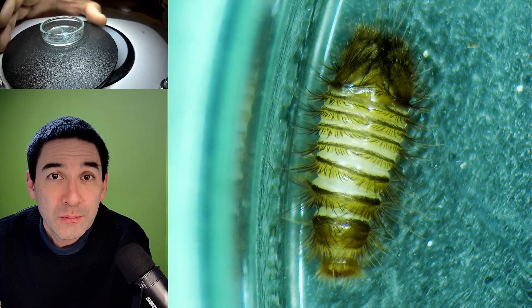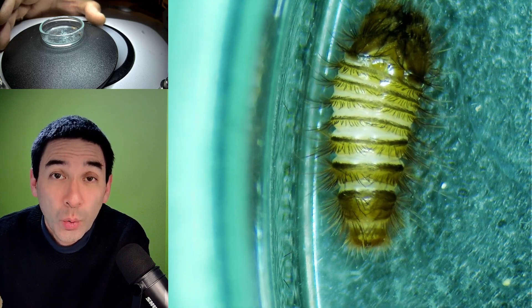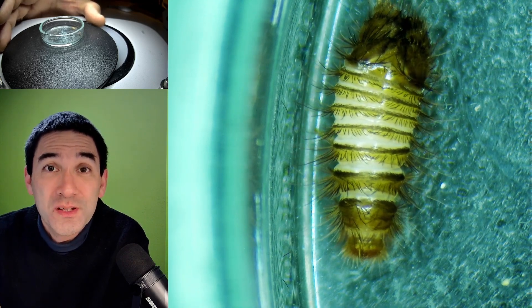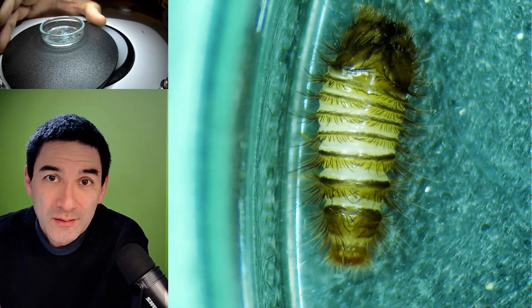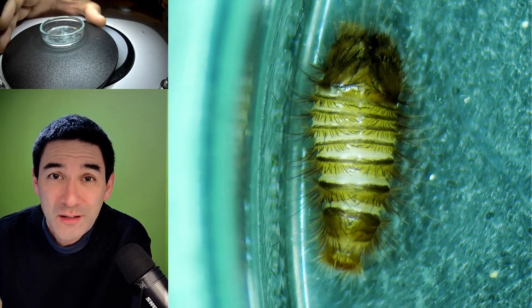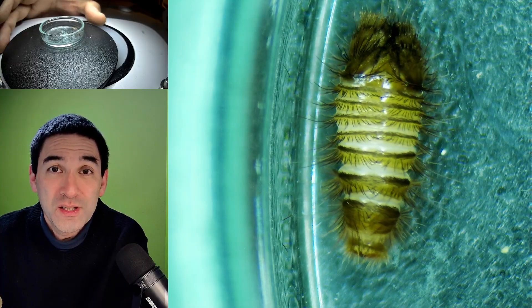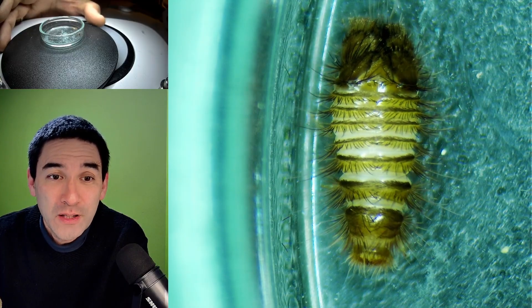And that's also the protein that can be found in fingernails and in wool. That's why, because many carpets are made of wool, if you've got those little insects, they might actually damage the carpets. So what I'm going to do is shave off a little bit of my fingernail.